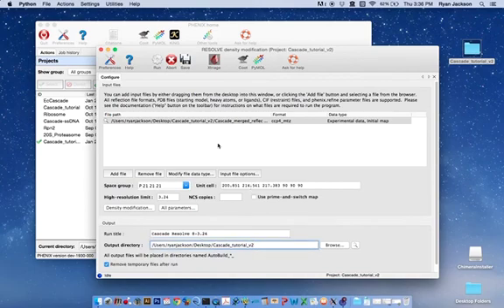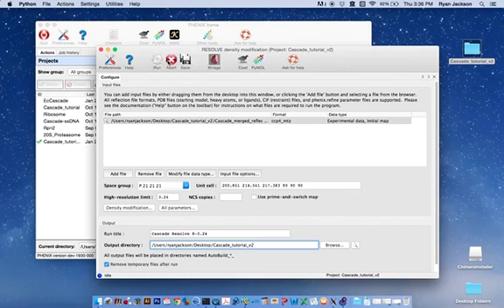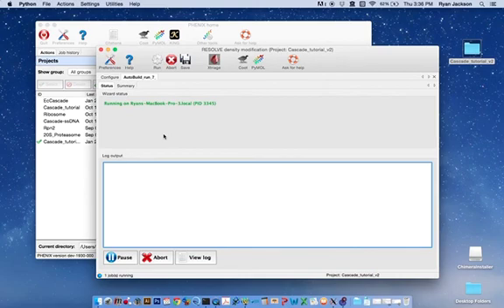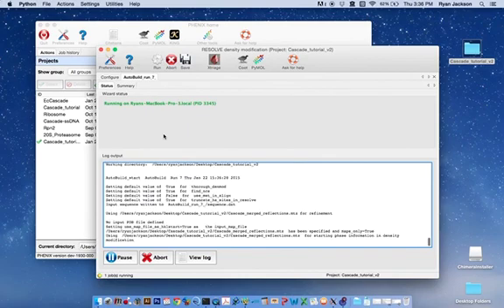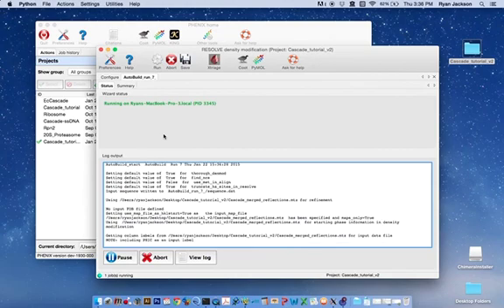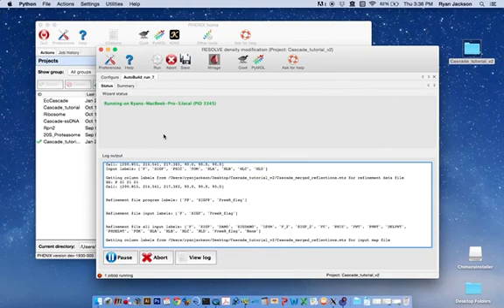We'll hit run and run now and it will begin the run. This will take upwards... It takes about 15 to 30 minutes for every macro cycle and so, in this case it could take upwards of 4 to 5 hours to finish the run using this data.